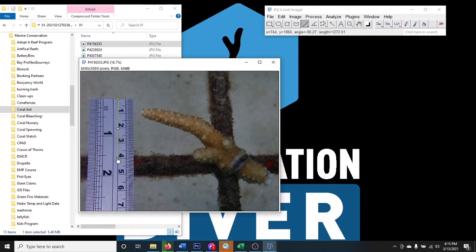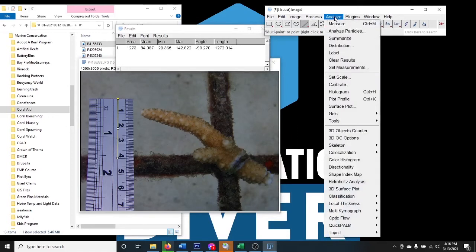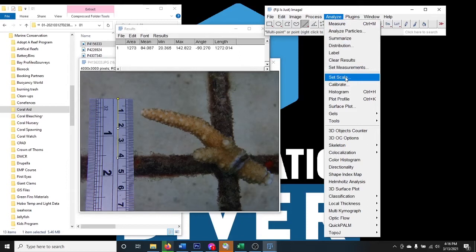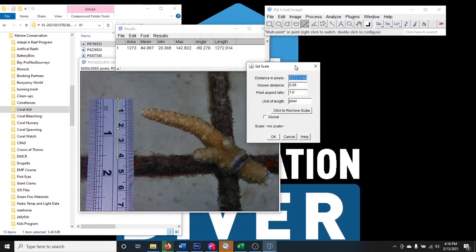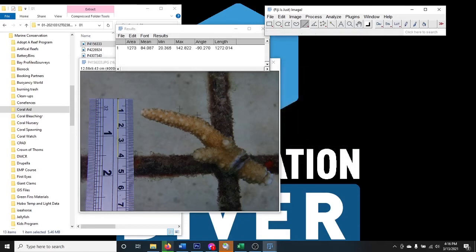Draw a line to four centimeters — you could go to three or six, it doesn't really matter. Once the line is drawn, hit Ctrl+M to measure it — or go to Analyze and Measure. This gives you the length in pixels. Then go to Analyze > Set Scale, which automatically takes that measurement and fills in the distance in pixels. Enter four for the distance and centimeters as the unit, then click OK.